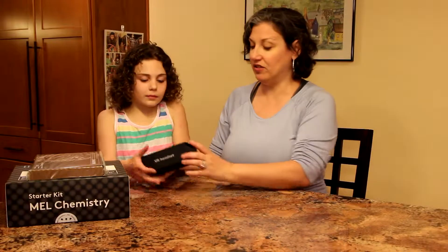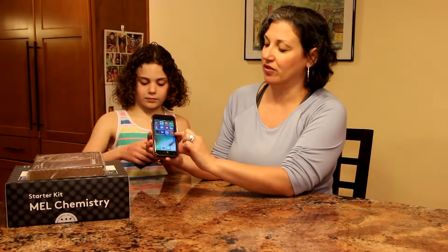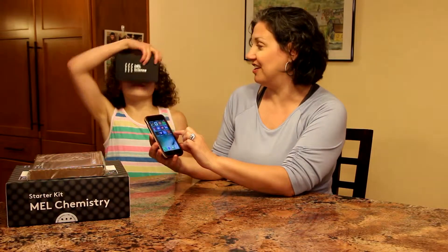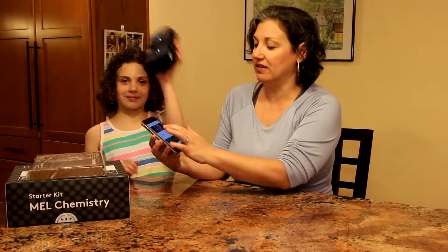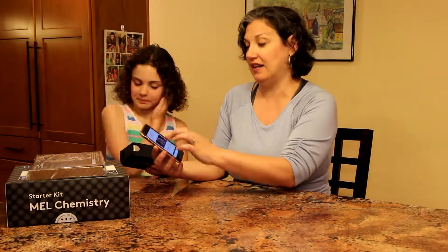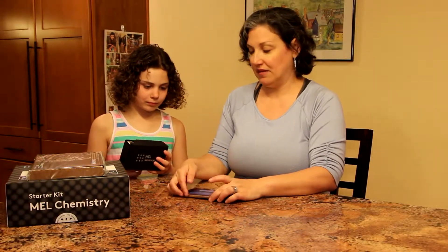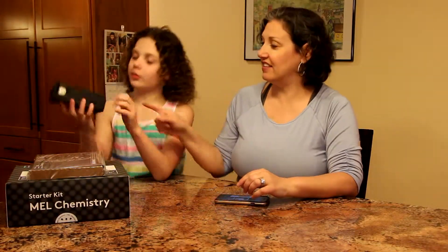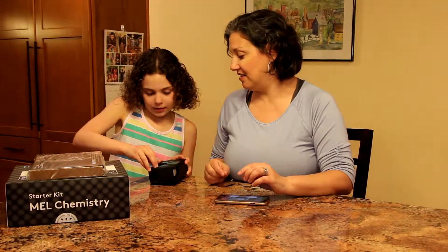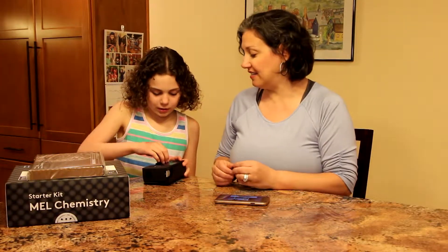Why don't you take that out of there. So there is an app that you can get. You won't be able to see it very well, but it's an orange or maybe reddish orange with nine dots on it. When you open that up, it has the different experiments in there. We will be doing the Tin Hedgehog and the Tin Dendrite with the Tin Lab. If you click on those, there are videos for you to watch. You open it up and it looks like that. There are some little things on here you have to take off — these little flappy blue things — they're just to protect the lenses that are in there.